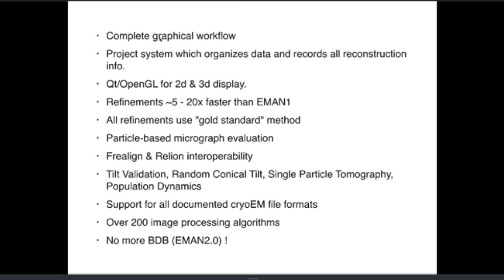So we have that associated with the project system. Basically, a particular project, a particular refinement, will live within one folder, and there's a set of standard naming conventions that we use for all of the subfolders inside the folders and that sort of thing. So the data is all organized in a fairly self-consistent fashion, which means if you ever need to go back and look for some particular bit of information as you're publishing, writing up a paper for your results, it's always easy to find. We use a combination of Qt and OpenGL for all of our graphics in the interfaces.